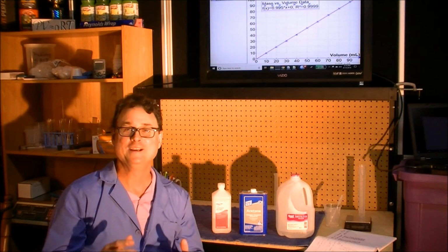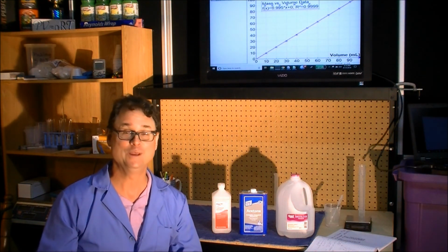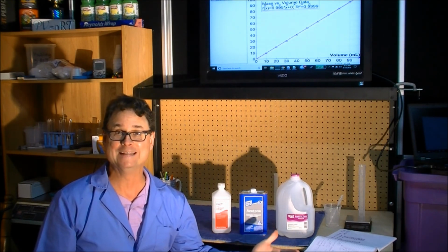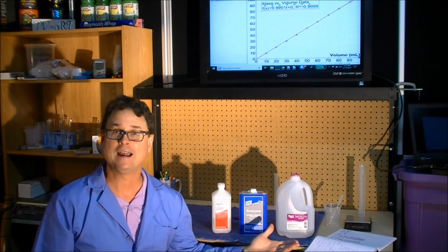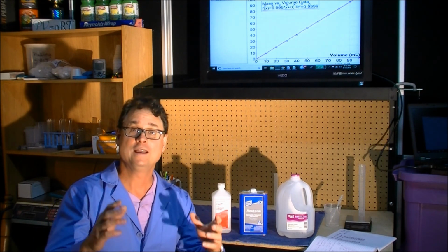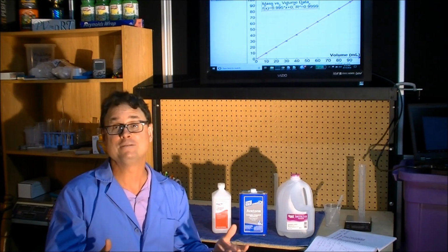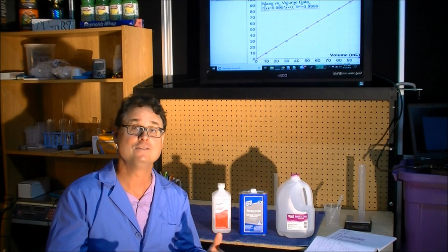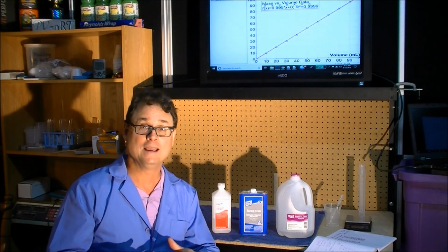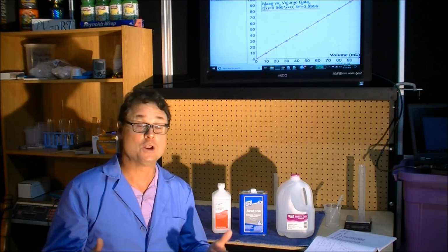Well, if you've ever read the instructions on a bottle of shampoo, it explains how to use shampoo, and then it says lather, rinse, repeat. And this is the stage of the experiment where we're at the lather, rinse, repeat stage. I don't think you're going to learn much by watching me repeat the experiment in acetone and isopropanol, but you and students will learn a lot by actually going through and repeating the experiment with 3 different substances, because 3 different substances is going to give a much higher level of confidence that this hypothetical proportionality might be a more universal property of uniform materials rather than being something that only applies to water.